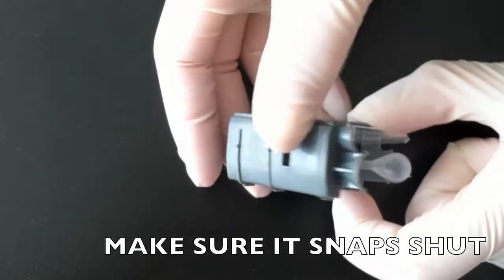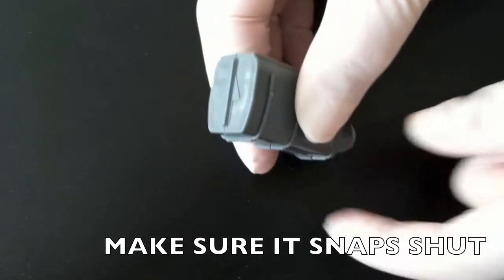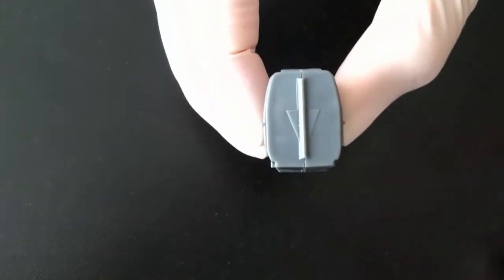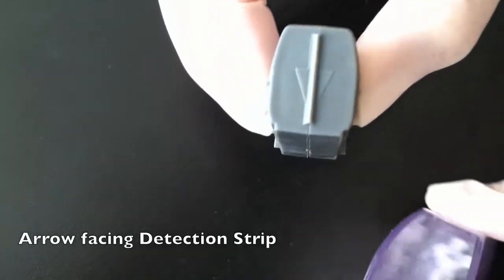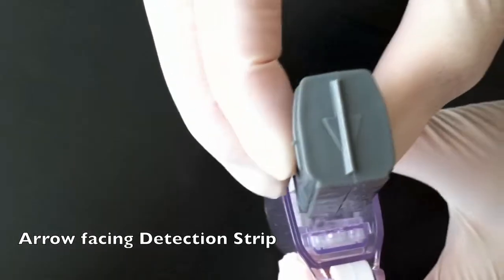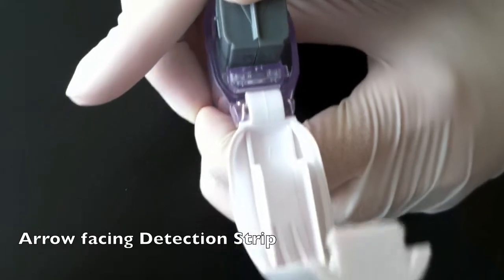Close the amplicon cartridge and make sure that it snaps shut. Insert the closed amplicon cartridge into the detection chamber. Make sure the arrow, located on the top of the amplicon cartridge, faces the detection strip.